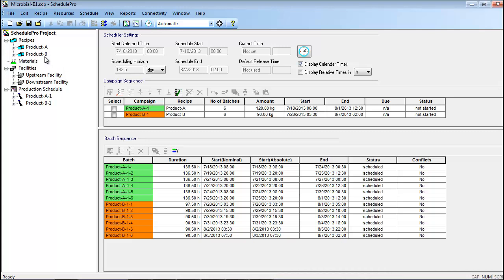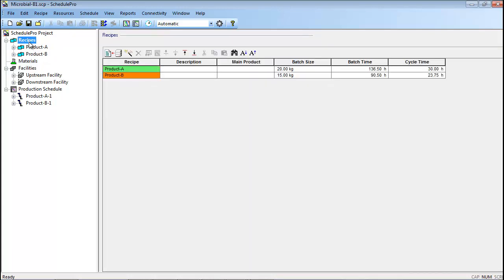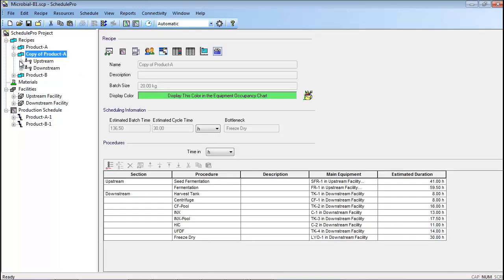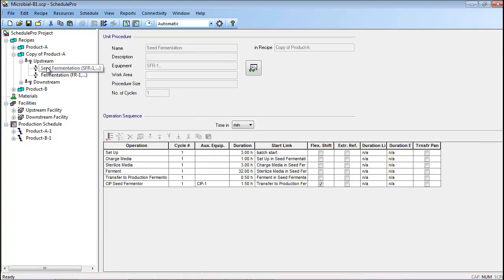These are made within a multi-product plant. Rather than creating the Product B recipe from scratch, the recipe for Product B was generated by selecting the Recipes node in the Explorer tree, selecting the Product A recipe in the pane on the right, copying and pasting the recipe, and editing the recipe to reduce the durations of the fermentation operations, reduce the centrifugation time, change the freeze-dry procedure to a bulk fill procedure, etc. This method of copying and pasting, followed by editing of the new recipe, is the recommended method for generation of recipes that are similar to one another.